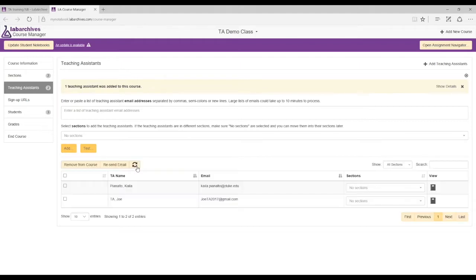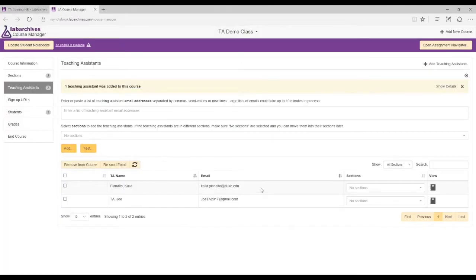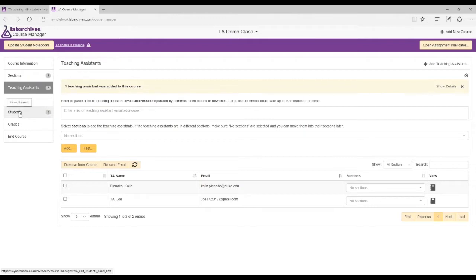I can now tell that you've actively joined my course as a TA. In the upper right-hand corner of your screen you should see a little icon that looks like a chalkboard with a pen next to it. Click on that and it'll open up the course manager. Your course manager will look a little different from mine — you have access to all the same tabs on the left side of the screen, but you can't do anything with them. TAs can't do that.